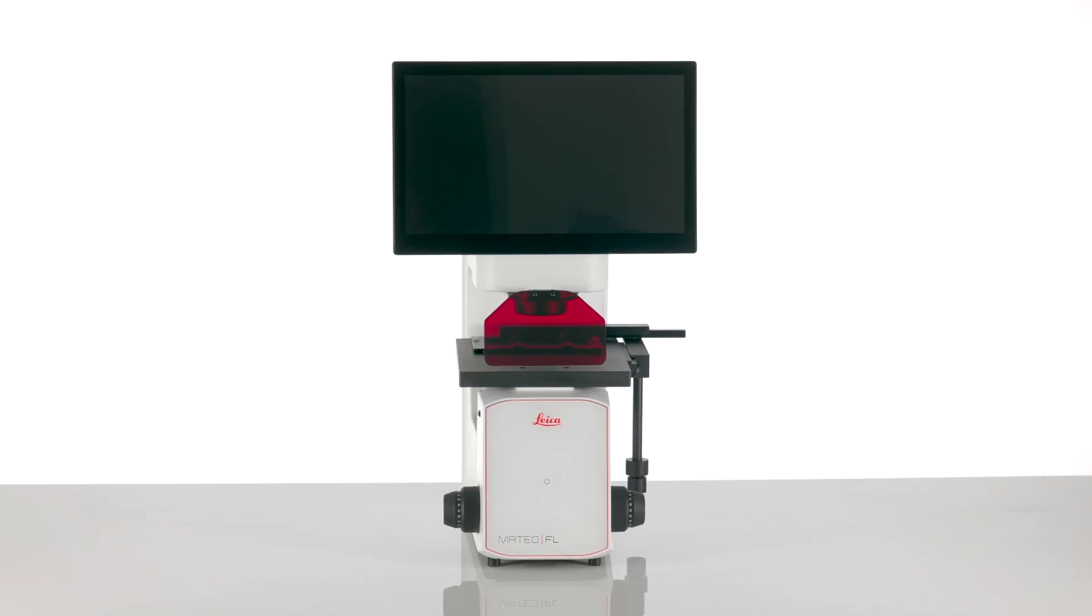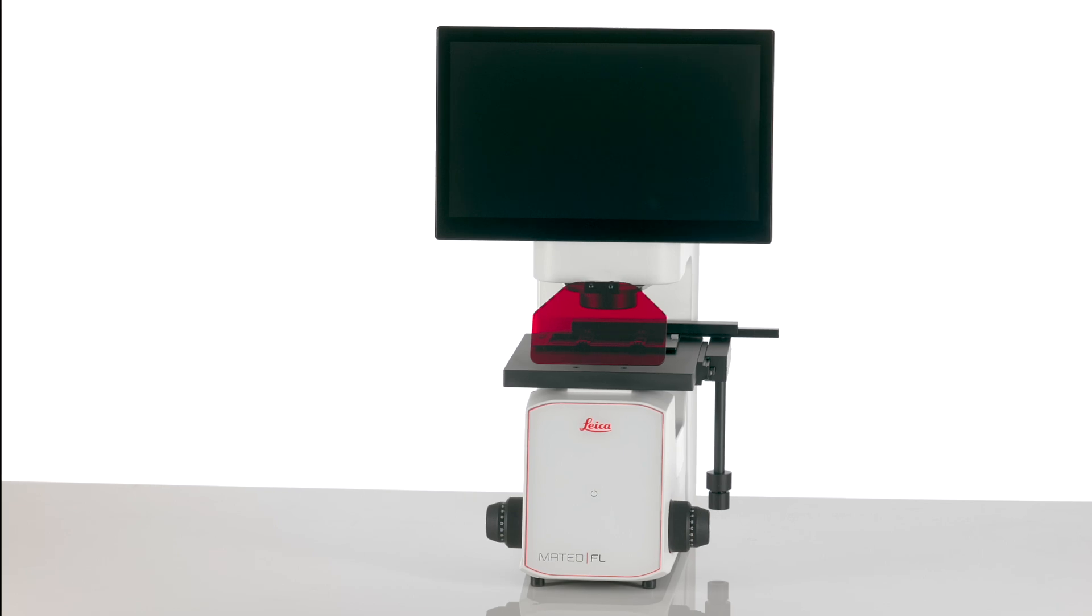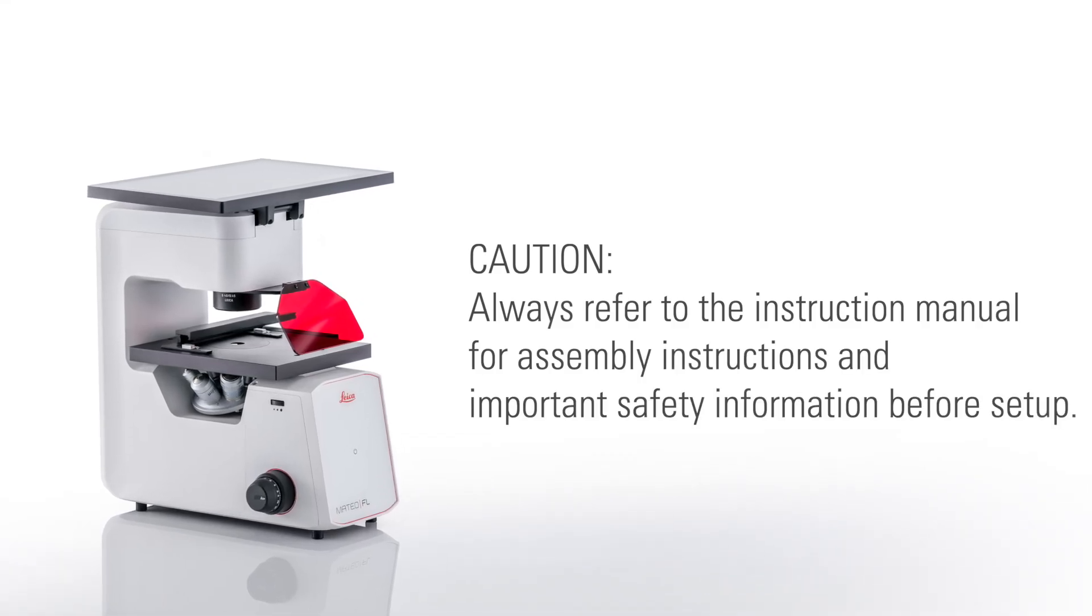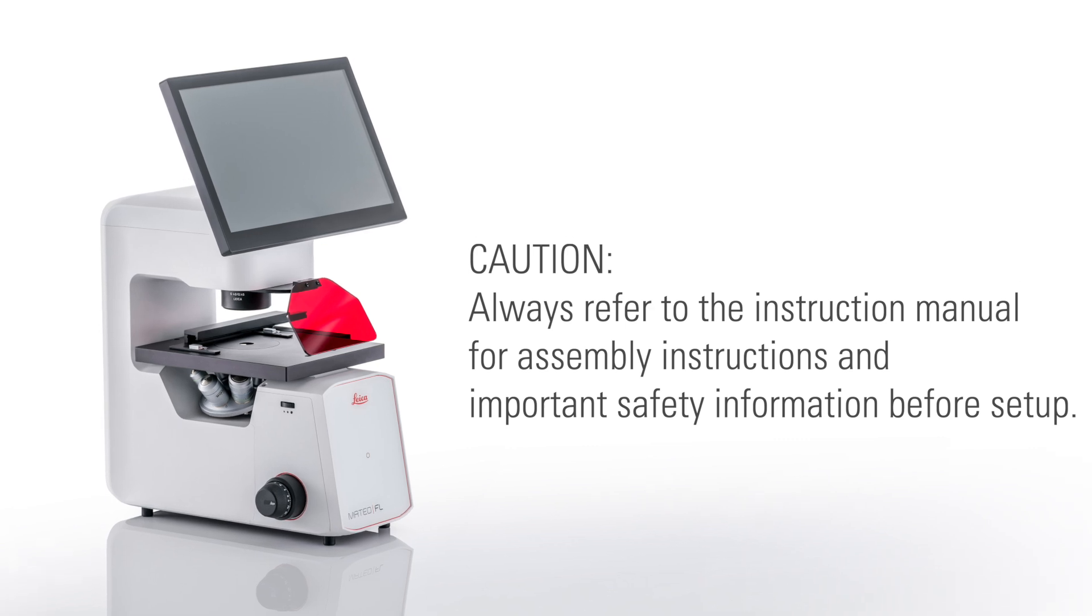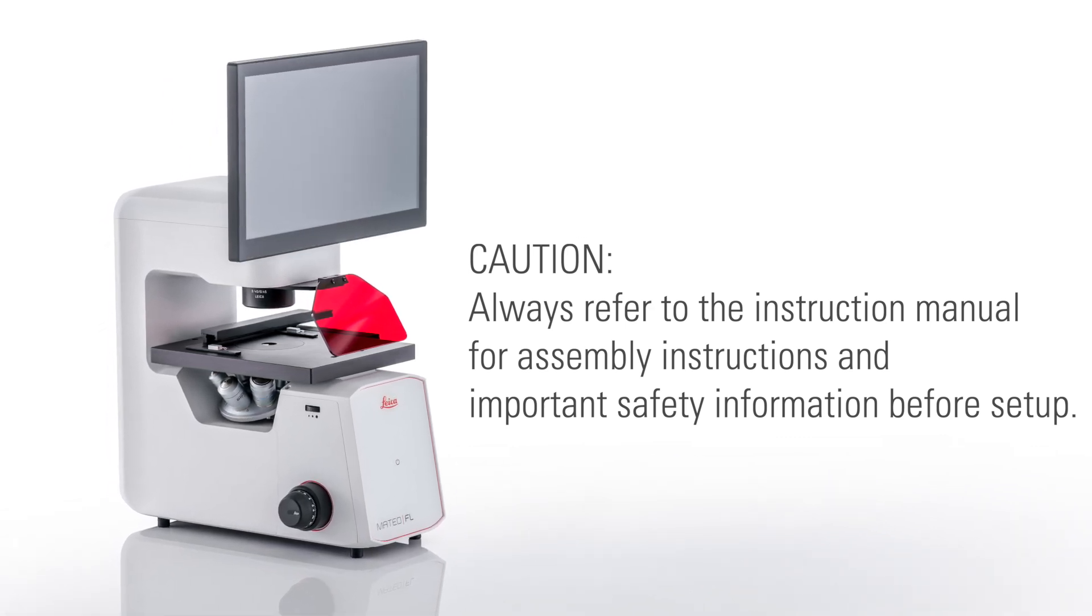Welcome to Leica Microsystems Setup Guide for the Mateo FL Digital Fluorescence Microscope. Please remember, you should always refer to the user manual for detailed assembly instructions and important safety information before starting to assemble your new instrument.